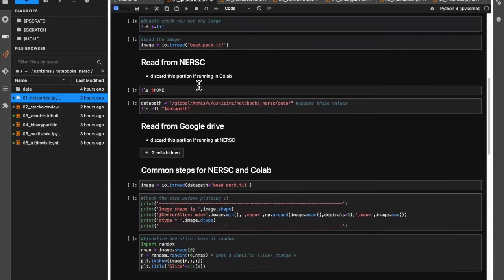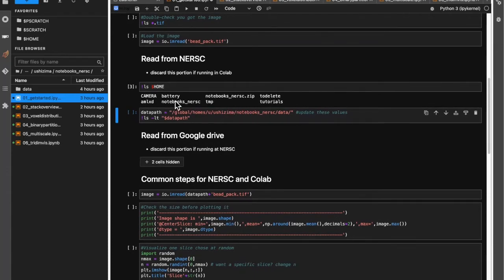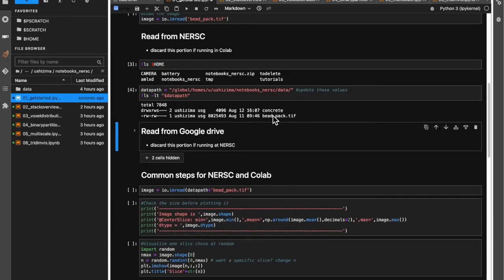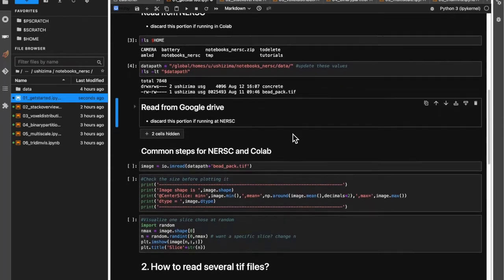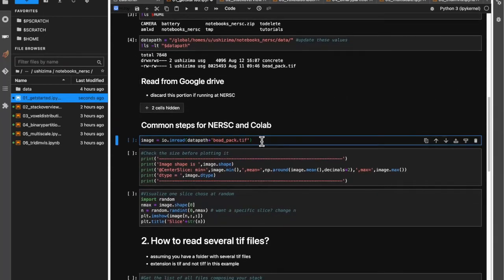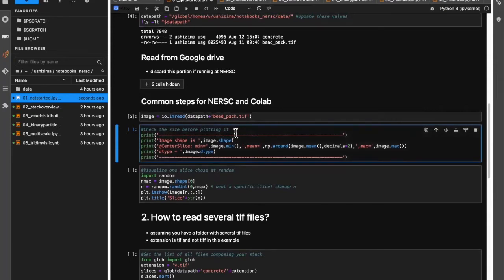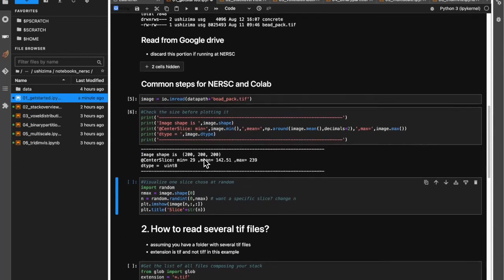Assuming that most of you have a NERSC account — so that's what you do. Notice that I'm using regular ls with an exclamation mark to check what I have in my home directory. That's what I have: I have my notebooks here. So the data path will need to be for notebooks. Notice I'm going to have one single multi-TIFF file called bead_pack.tif, and then a folder called concrete that has several slices of a concrete sample. Let's get started with bead pack. How would you read a TIFF file — in this case, a multi-TIFF file? It's good practice to understand what you have there. What's the image shape? That's the size of the array that contains your image.